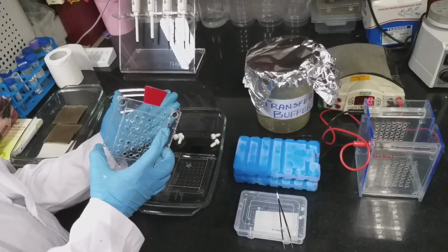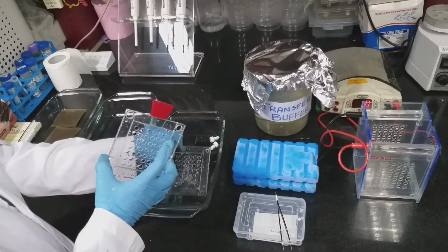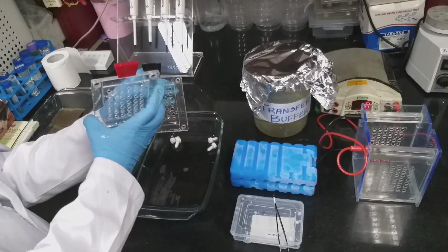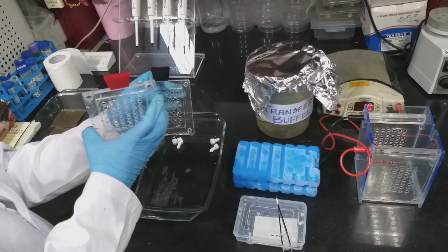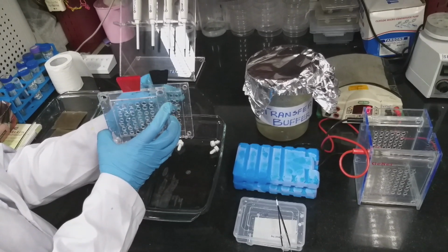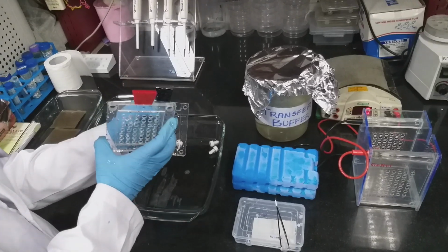When we apply voltage from this side to this side, the negatively charged protein will move to the positive side and be captured in the membrane.